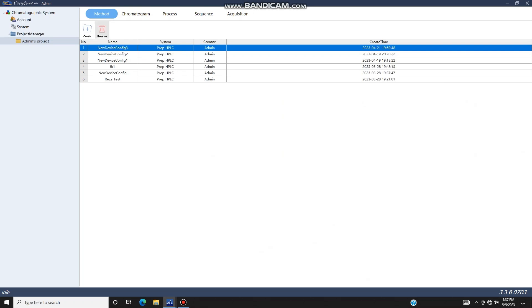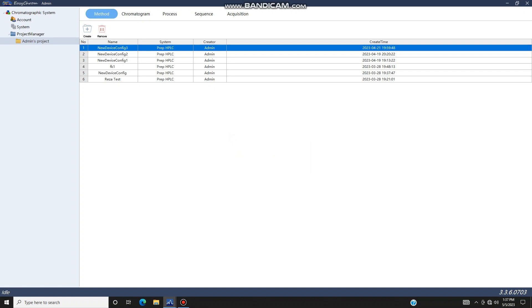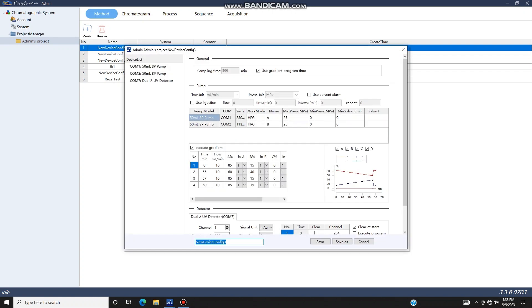As with the analytical system, you can select an existing gradient under Method on the first page of the software. Simply click on a saved gradient to call up its settings. Here you can see your flow rate at 10 milliliters per minute. You can go up to 50 milliliters per minute if you like. You have Pump A and Pump B here, and Channel 1 and Channel 2.